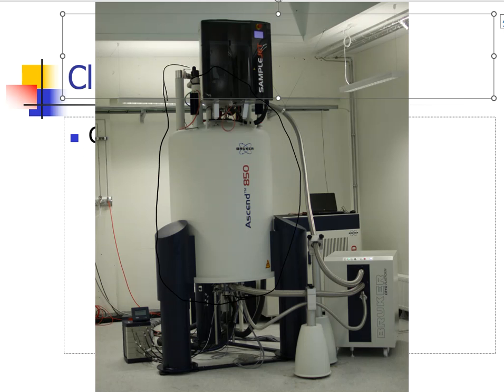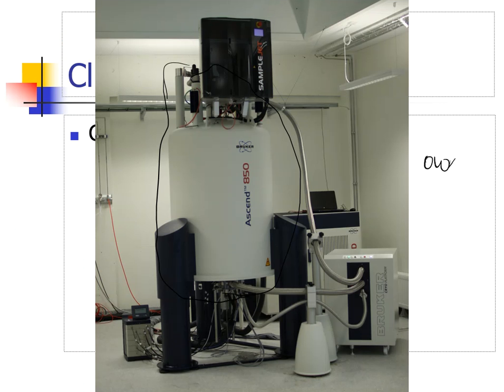So we're often going to see NMR instruments that are very large in a room, and because this works off of magnetic properties, very often these are in their own room. All right, so they have their own dedicated space. They do not share it with anyone else. We try to keep computers and any electronic devices away from them if that's possible as well. So the cables typically are fed into a computer system that might be present in a completely different room. And this is what I would call the big boy NMRs, all right, or the big girl NMRs.